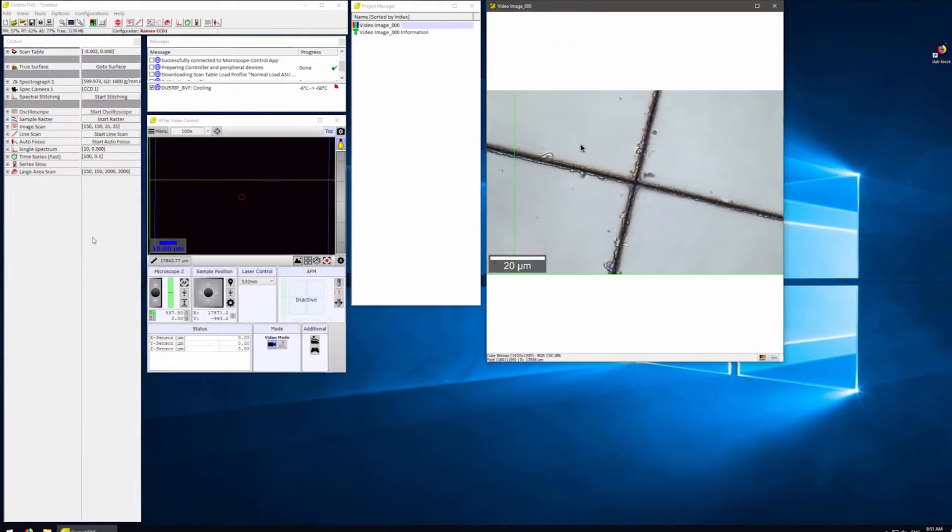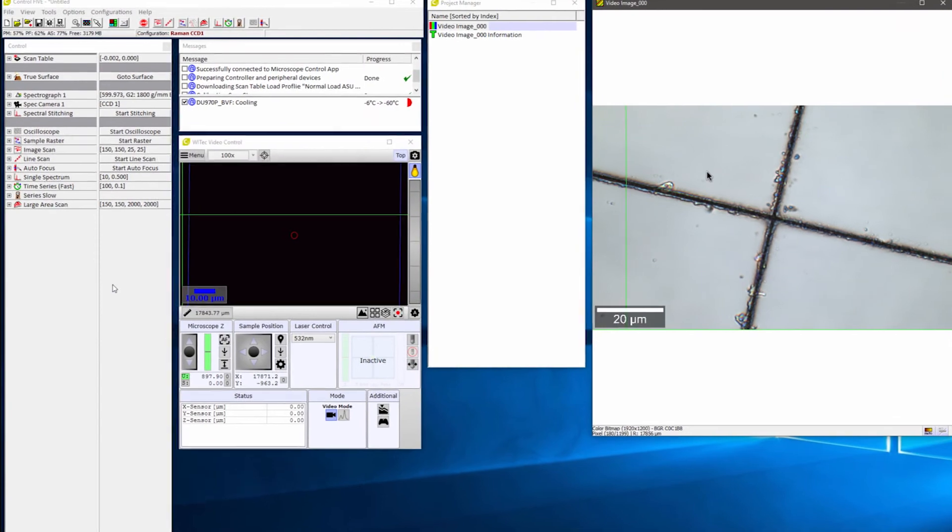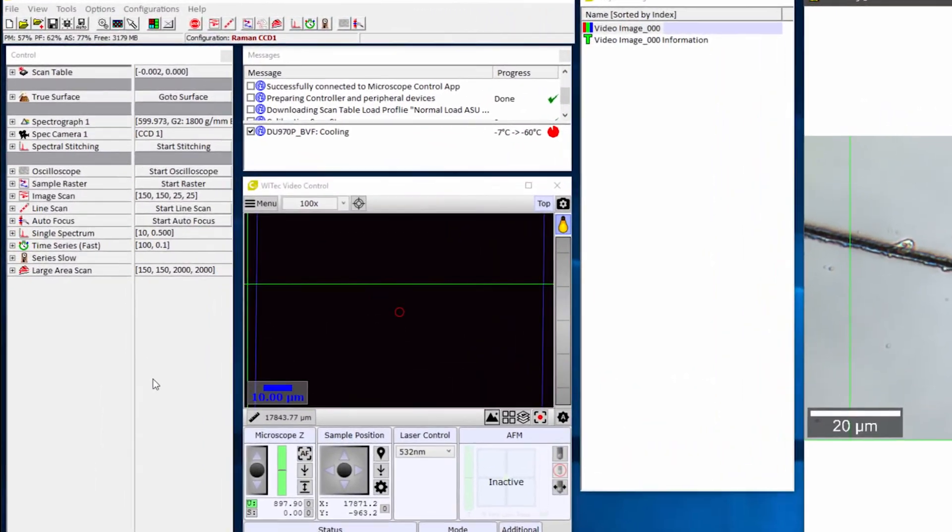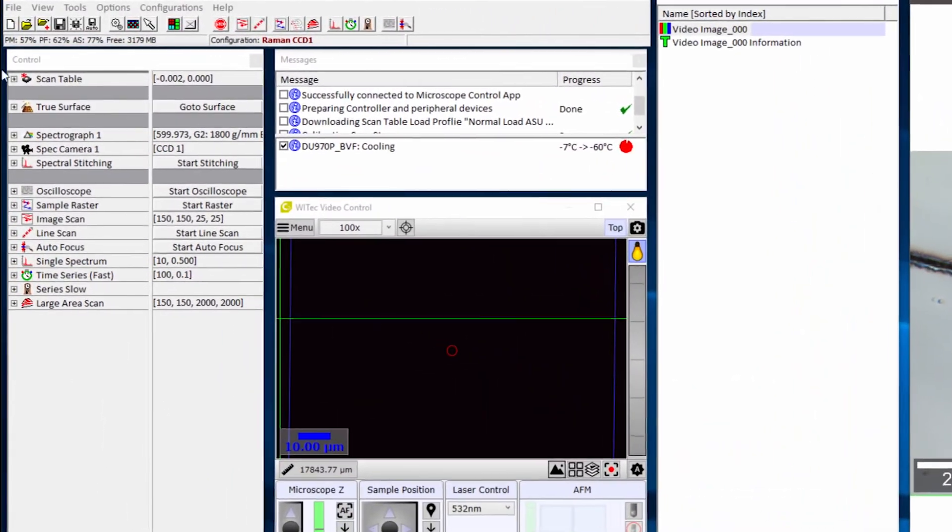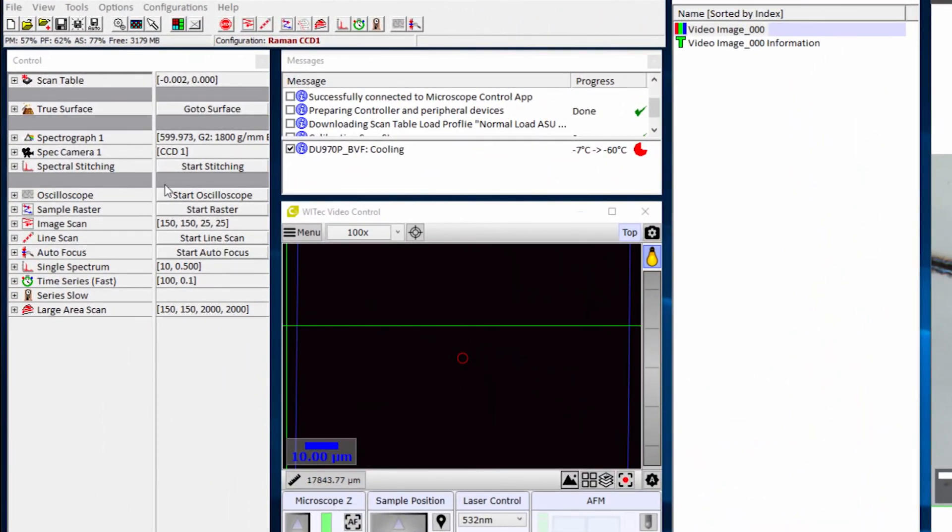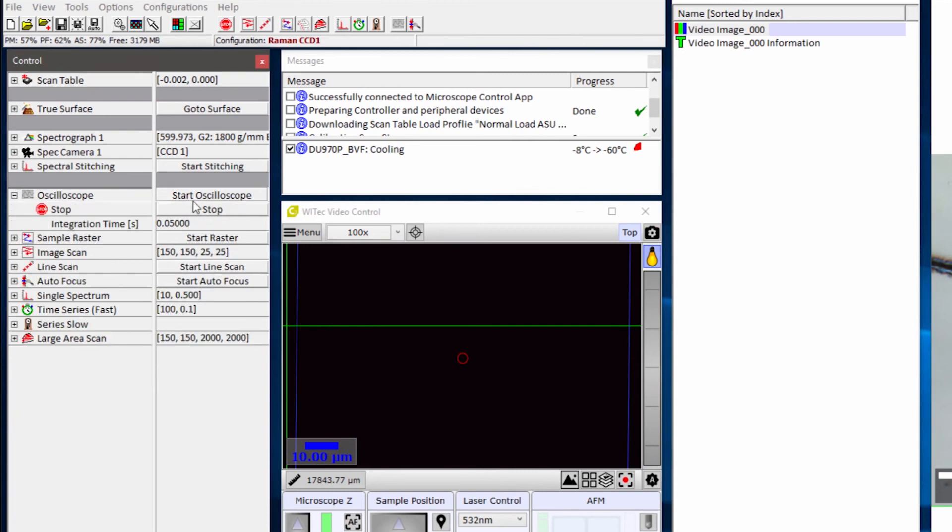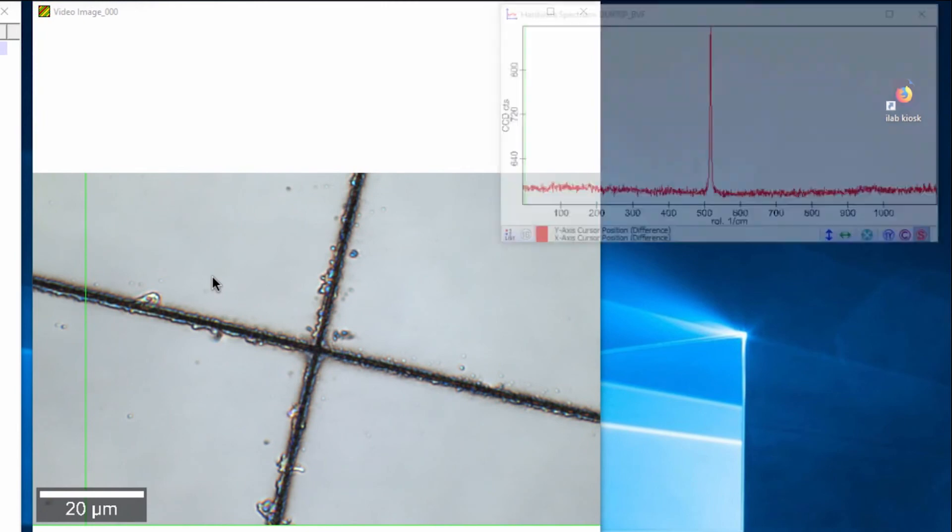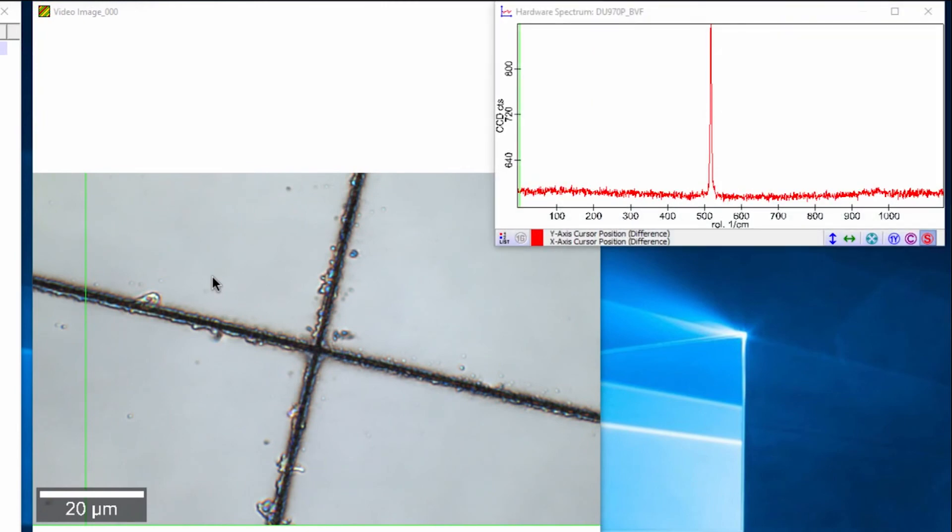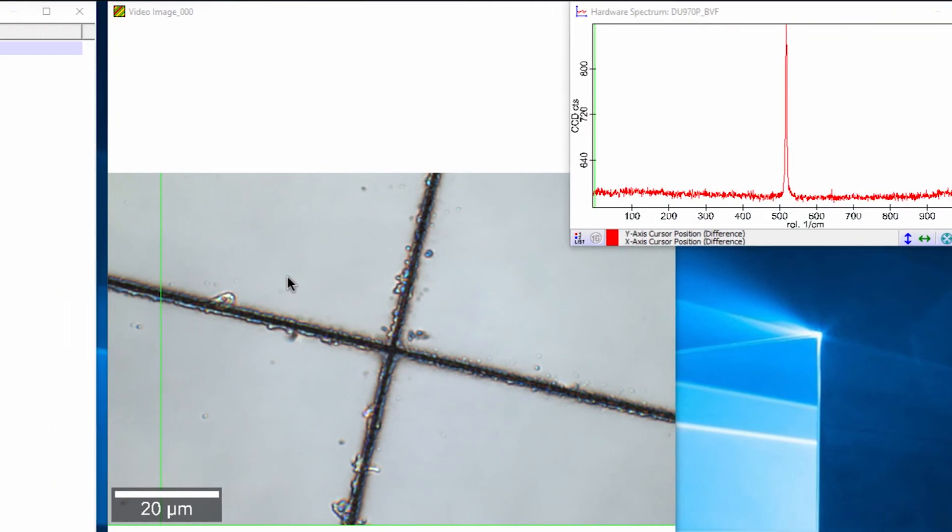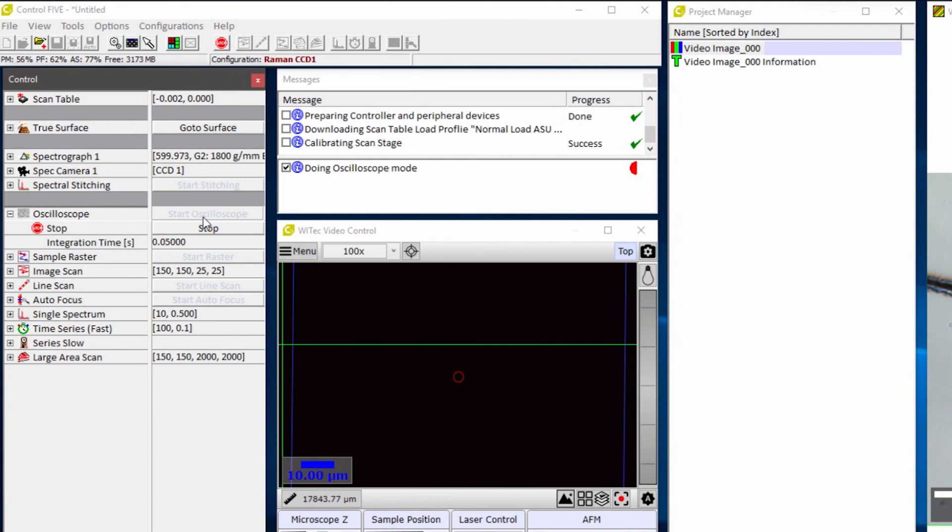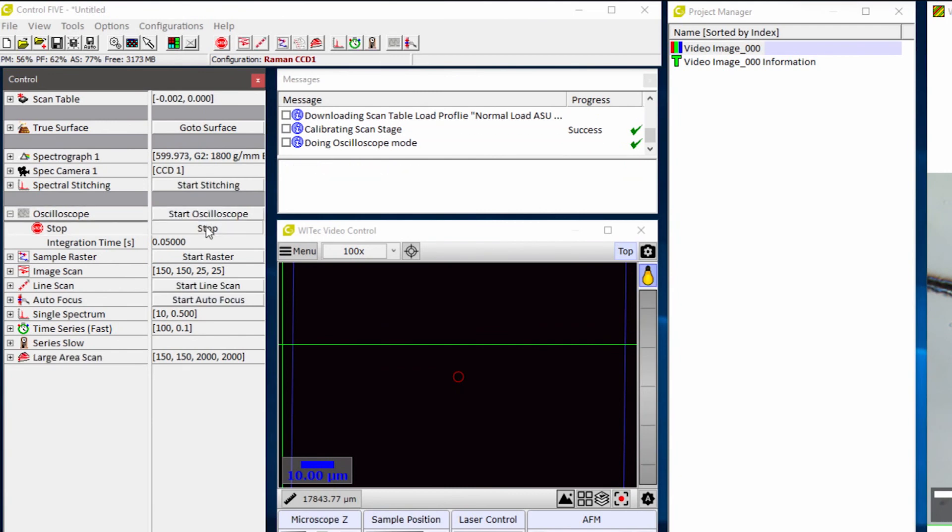The first thing we want to do is use the oscilloscope mode to have a quick look at our pattern. We can click oscilloscope and then start oscilloscope to see a pattern. Now that we see we have good signal, we can stop oscilloscope.